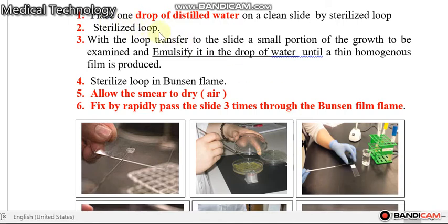Sterilize the loop again with the Bunsen burner. بالبداية عقبنا اللوب، بردنا، أخذنا قطرة من الماء، خليناها على السلايد، بعدها انعقمنا اللوب مرة ثانية، ثم بردنا اللوب.